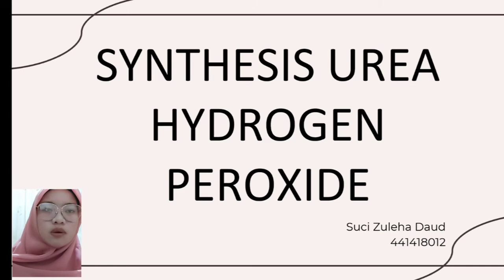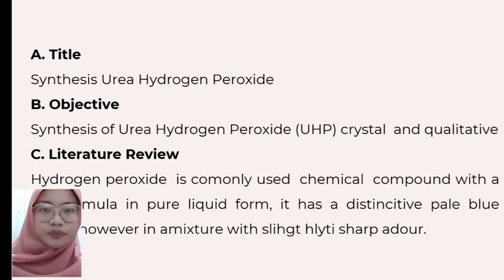I can explain about practicum synthesis urea hydrogen peroxide. Title: synthesis urea hydrogen peroxide. Objective: synthesis of urea hydrogen peroxide or UHP crystal and qualitative analysis.